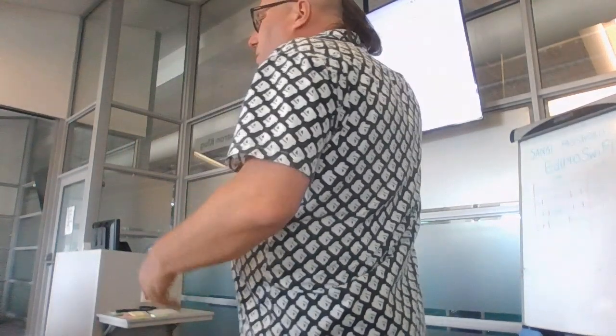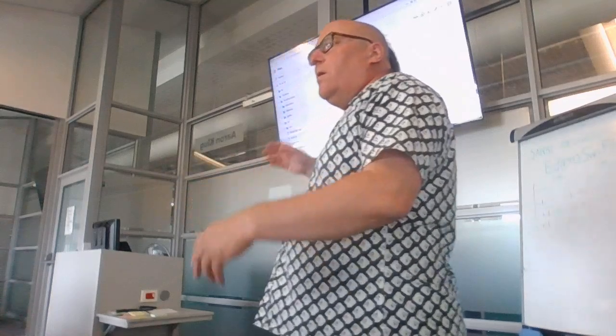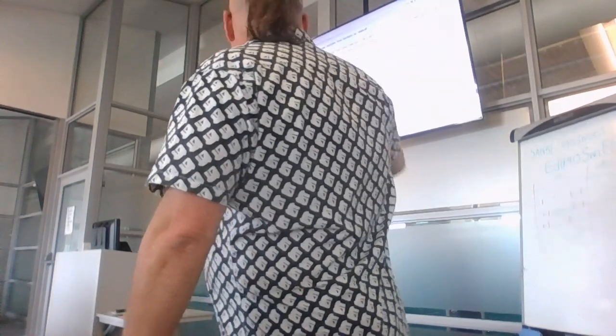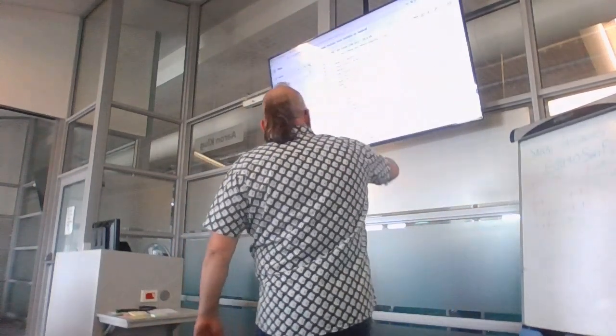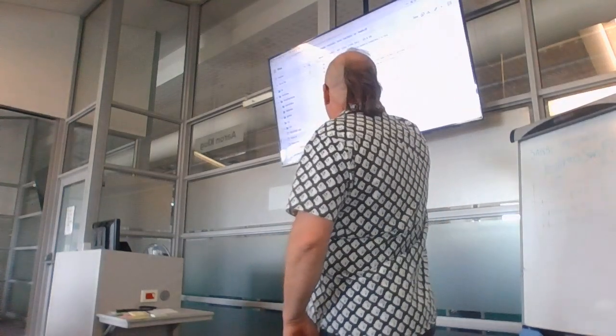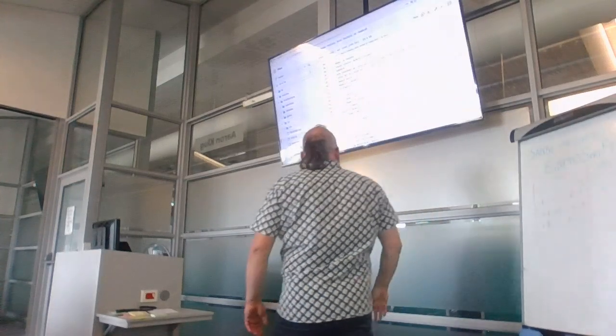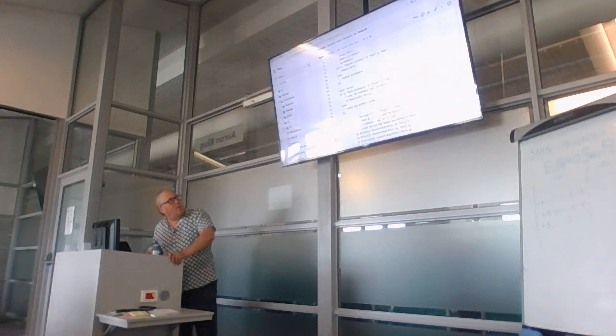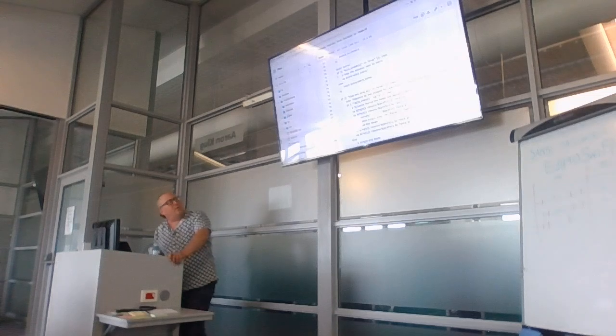So that's because hybrid means a mixture of nanopore and Illumina, and short polish means polish with short reads. So if that's the kind of run that we're going to do, then enable both of those things and tell it that, and line 63, say it is hybrid. But if the run type is ONT, then enable ONT. Otherwise enable Illumina, okay? Then, if it is assembly, you can include pre-assembled data. So if it's assembly, then just copy that across. That's not what we're dealing with, okay?